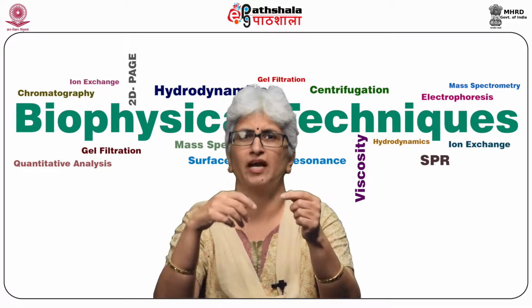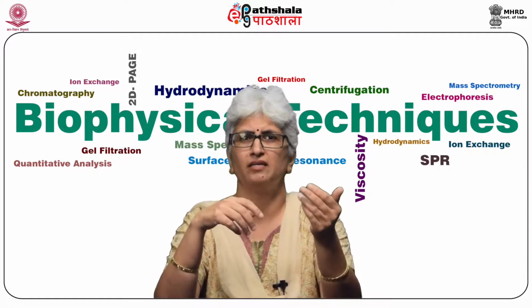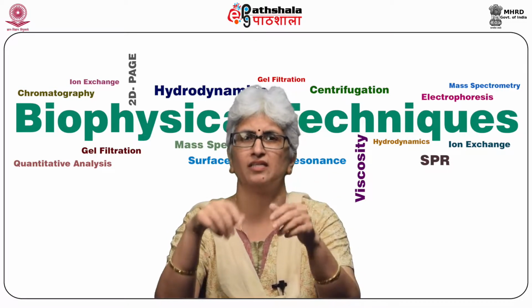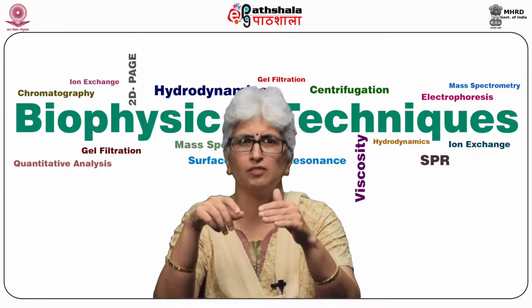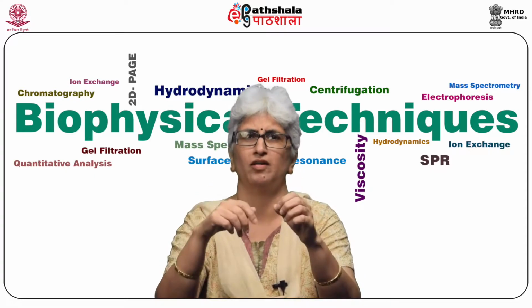A specific antibody purified with this method might be contaminated with other IgGs or similar molecules if present in the crude sample. So this method allows only partial purification of antibodies.